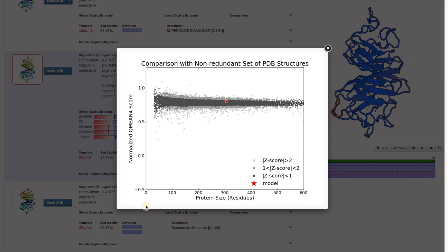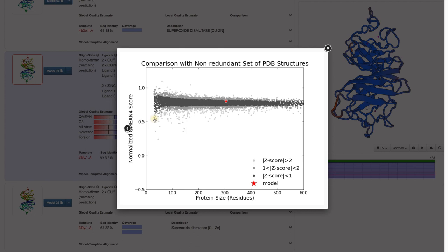On the x-axis we have the length of the protein structure, and on the y-axis the score of these properties. Every dot in the plot represents one structure from the PDB database and the star is our model.